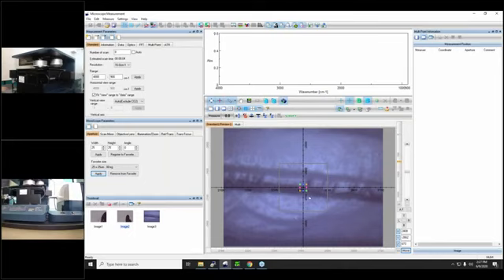This is the cross section, and these two materials that we can see have different intensity, or one looks in light color and the other is dark. These two are two different polymeric materials.